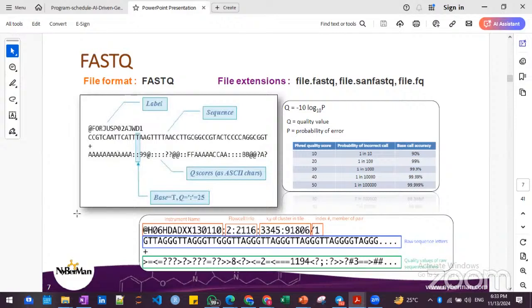So sometimes your tool keeps giving errors again and again, and some tools also give a clear instruction that maybe this error is because the header is missing in your FASTQ file. So you can clearly understand that your FASTQ file is incomplete or not properly given in the header line. So you can open the file and see it at that time.